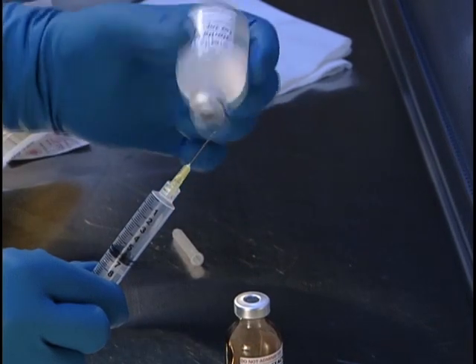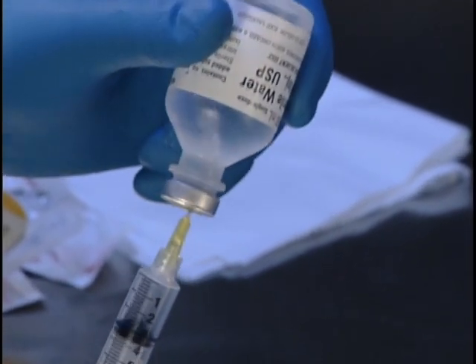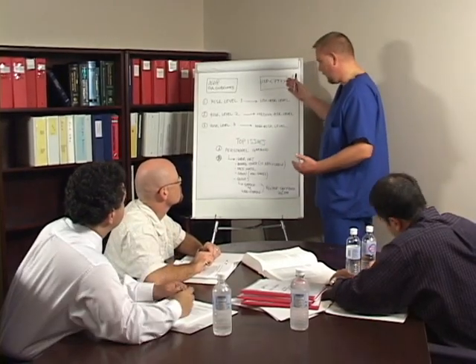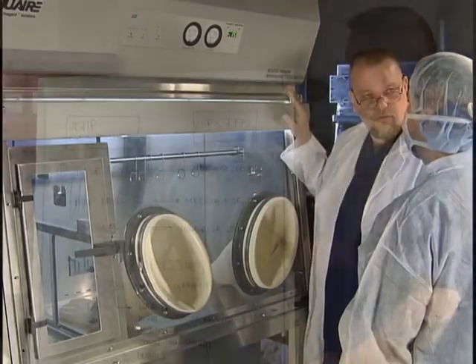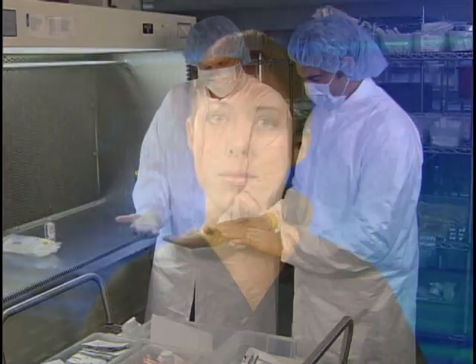Although the parenteral route of drug administration offers many advantages, it also has some unique preparation requirements. Since the drug or solution is being injected directly into the body, it bypasses the body's barriers to infection. Therefore, it is extremely important that the solution be sterile, that is, free from bacteria or other living organisms. Special training is required for all personnel who prepare and administer sterile IV solutions. If a contaminated drug or solution is inadvertently injected into a patient, the adverse effects can be fatal.